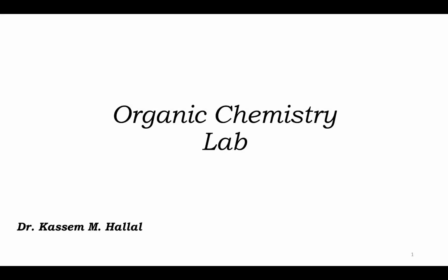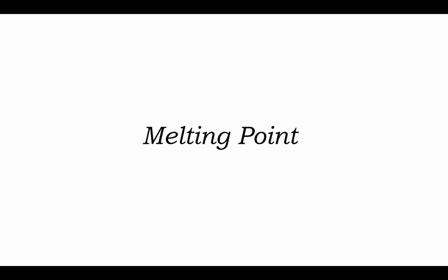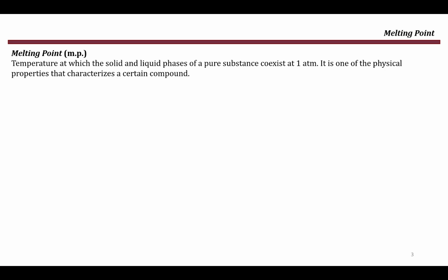Hi, in this video I will define the melting point of an organic compound, briefly discuss the factors that determine the melting point of a compound, and then talk about the importance of melting point measurements in an organic chemistry lab.